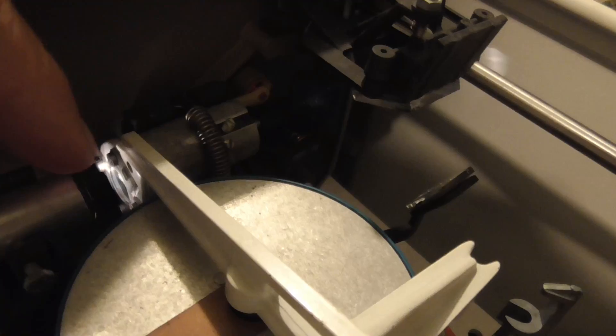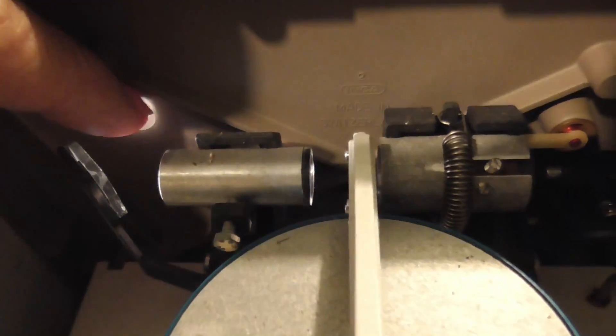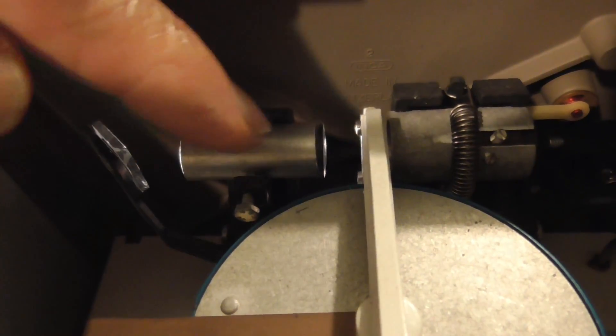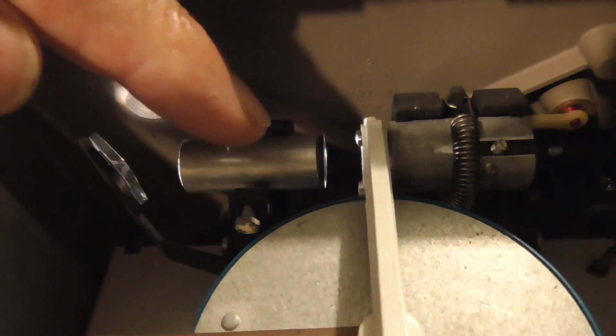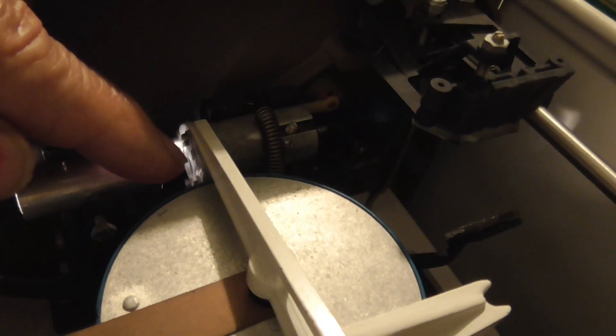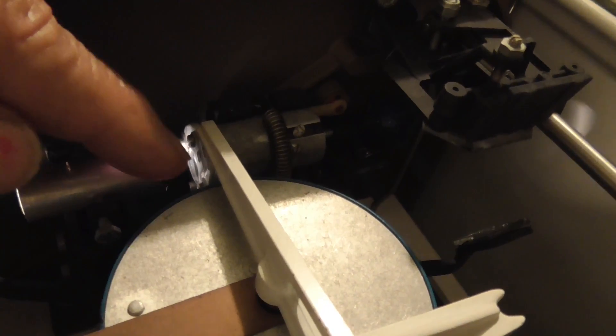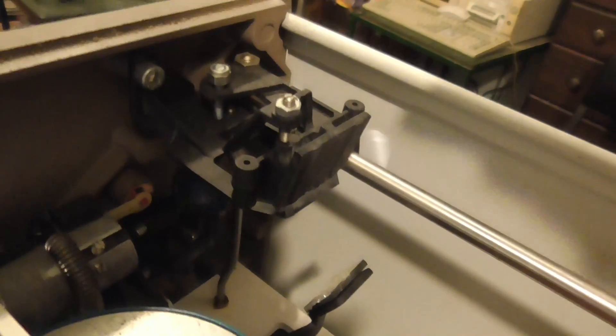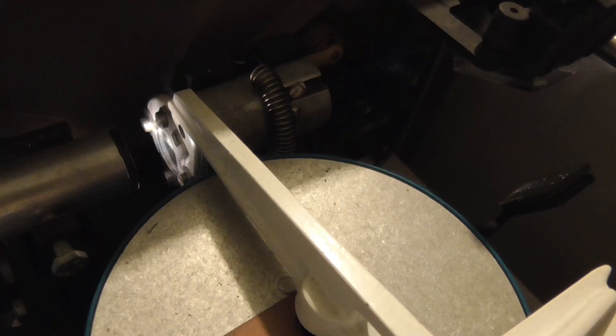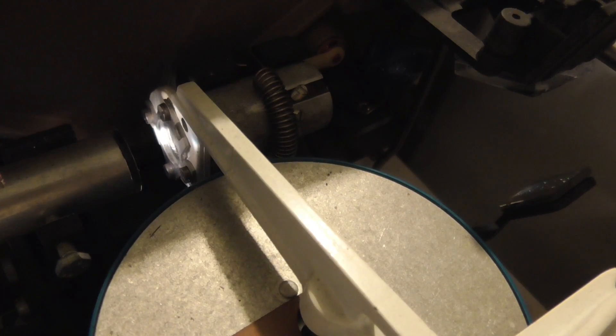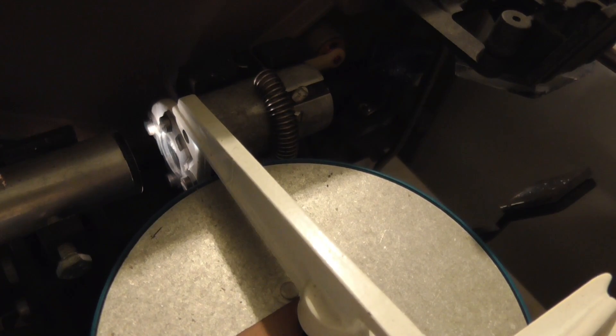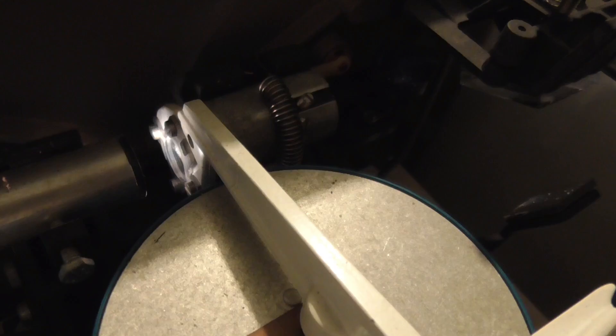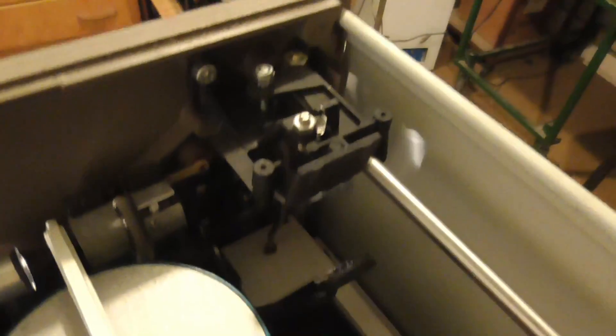And if we look carefully over here, we can see we have a little scale over here, and that's in a light beam. The light itself comes through here, goes onto this mirror, and through this lens mechanism, and then it's projected onto this scale. When this moves up and down - see how sensitive that is when it moves? It takes just 100 micrograms to move that one division on that scale.